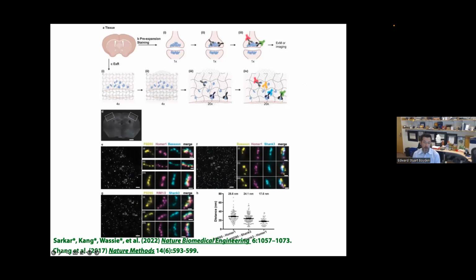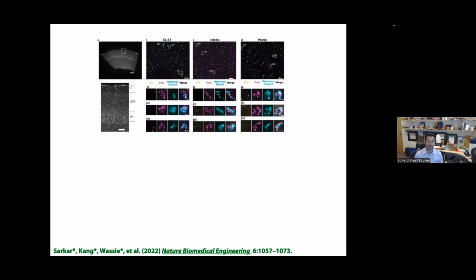So we wondered, in neurons and other specimens, there are all sorts of examples where molecules are jam-packed together. Maybe these molecules would benefit by being expanded away from each other and, in the decrowded state, being labeled. So working with Tom Blanpede at U Maryland and others, we decided to try to figure out if some of these proteins at neural synapses were too crowded to label, and if decrowding them from each other would benefit the specimen labeling and maybe even make invisible proteins into visible ones.